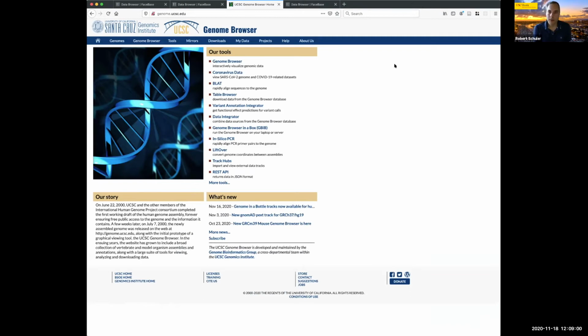So we operate what's called a track hub, and that is a registered hub of genome track files. All of the data that gets submitted to FaceBase, if it's submitted with track data, gets pushed onto our track hub, published out to our track hub, and it is then available for anyone coming to the UCSC Genome Browser or other genome browsers if you want to link to our track hub. But we're registered with the UCSC Genome Browser. So, for those of you who use this, you probably know where I'm going here.